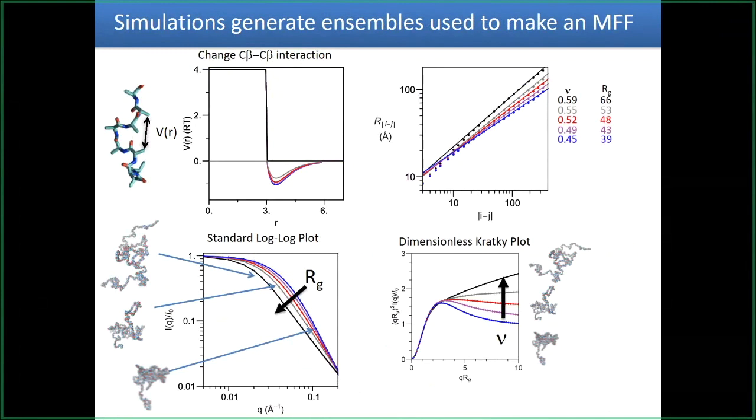One question: what is the optimal protein molecular weight that works better for this method? I translated that into two things. You can't be a trimer, right? You can't be on the order of the persistence length. As you look down here, we get some deviation, so don't go below 10. The other answer is, if you're a protein in water, you have to worry about hydration. I don't have a sense of PEG and DMSO; I haven't thought about that. So the two issues: one, you can't be near your persistence length. Two, you can't go so far out that hydration makes an issue.